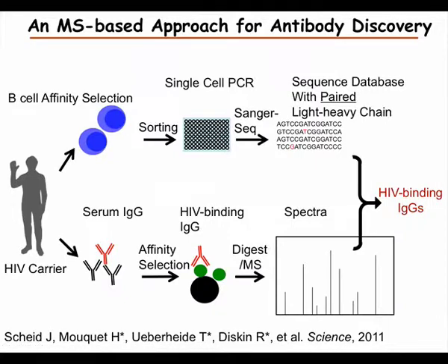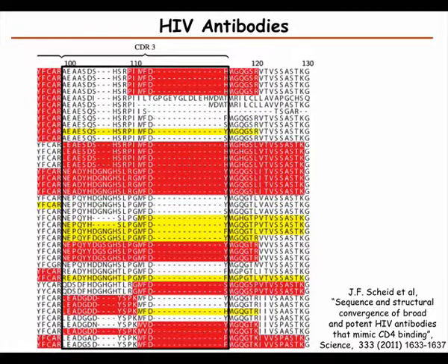Together with this, we can search the mass spectra in our database. And this just shows one clone. So you can see that there's quite a big clonal expansion with variations in the sequences that we have in this one clone.